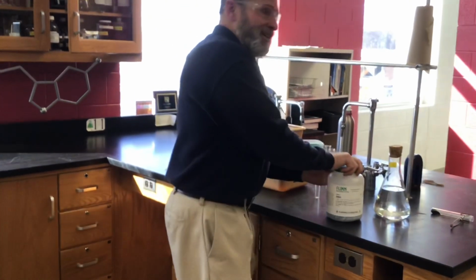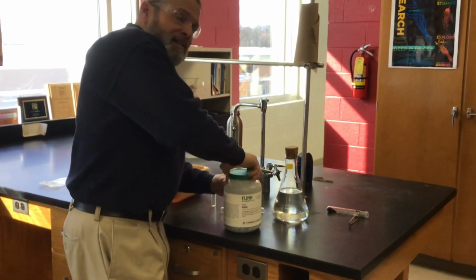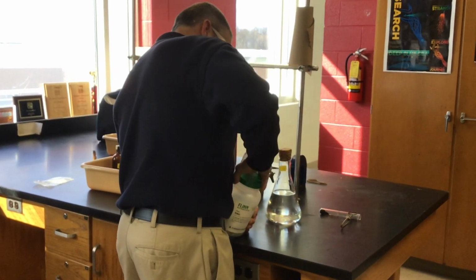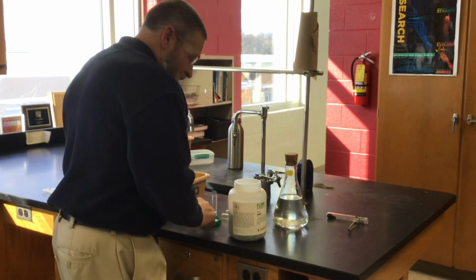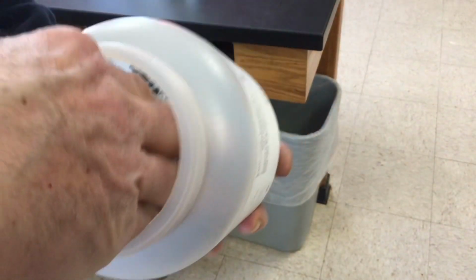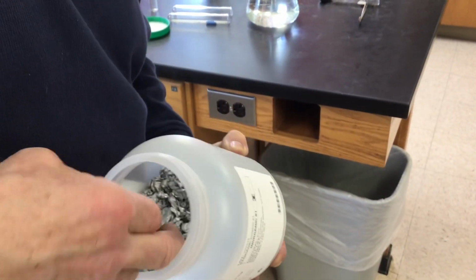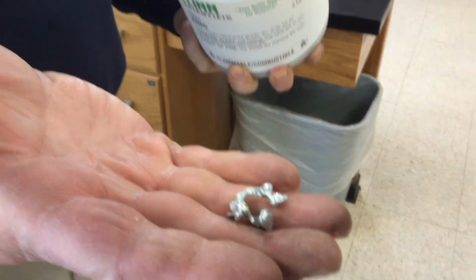Oh, that's right. Oh, and you know what? That's a new bottle, so we're going to have to rip up the plastic, I think. Okay, guys, so this is called mossy zinc. I always thought it was an interesting name. It's chunks of zinc metal. I can get a hold of one. Almost looks like it was at once melted and just kind of dripped off or whatever, right?